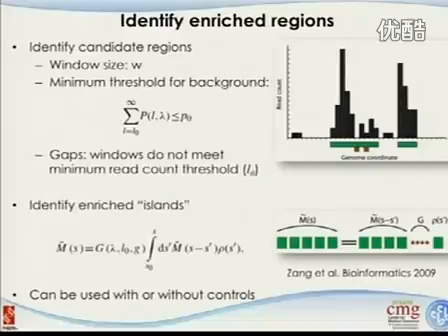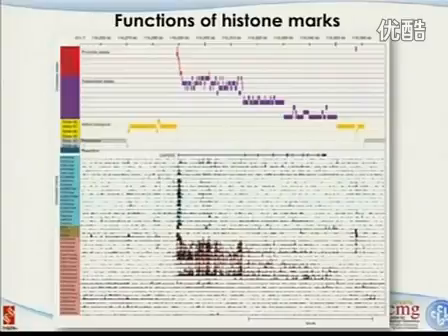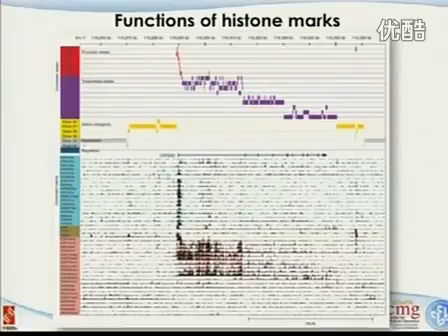This is the enrichment. And the later one that I talked about here is some computational effort based on different histone markers, trying to understand what histone marker encodes for what. We know histone 3 K4 trimethylation encodes for promoter, but there are many histone markers whose biological meanings we don't understand, and this is one of the ways that helps with that.